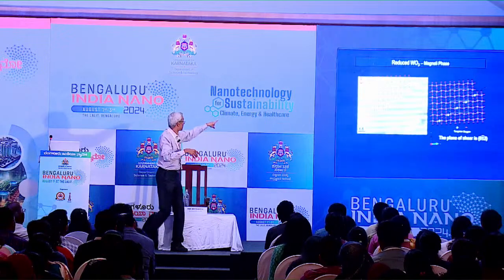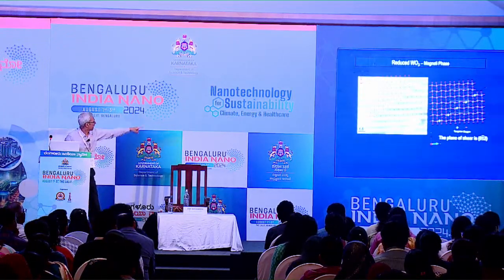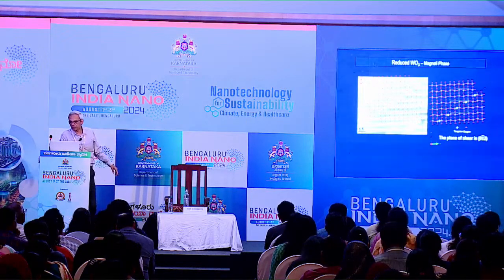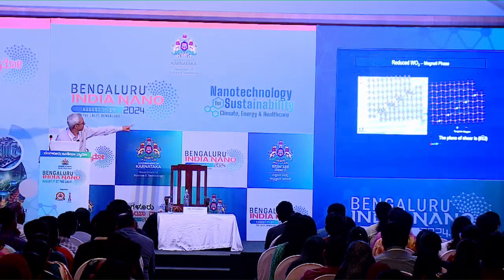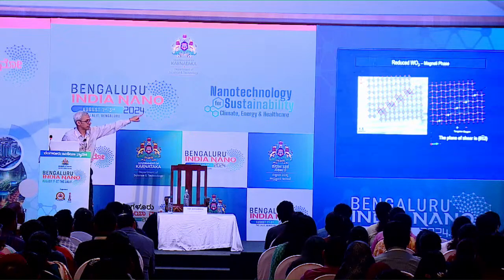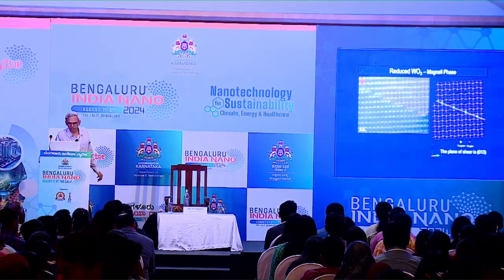Never mind the details, but you can actually see those details directly in the electron microscope. That is basically what is shown as a crystallographic shear structure. Okay, so that is the power of the modern day microscope. The octahedra that are corner sharing at the boundary become edge sharing. Okay, so I'll skip this particular thing.